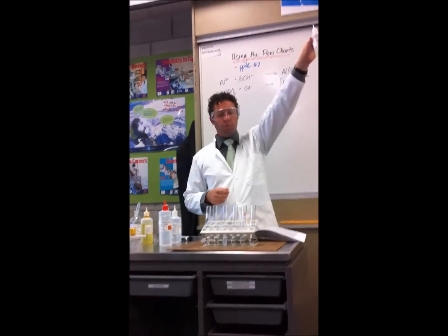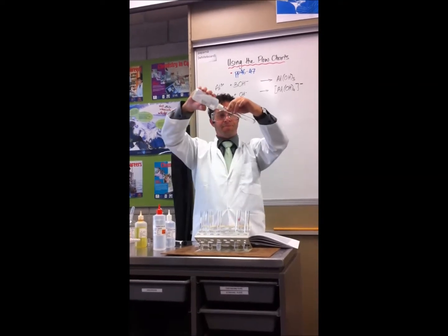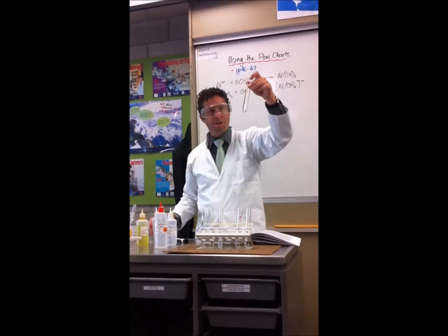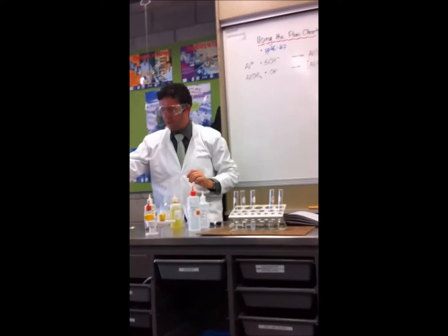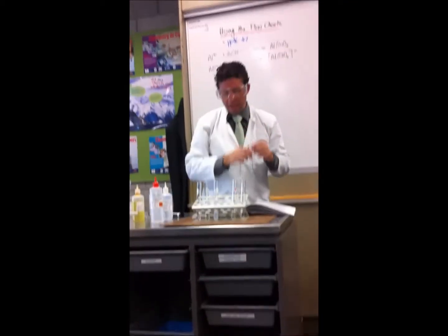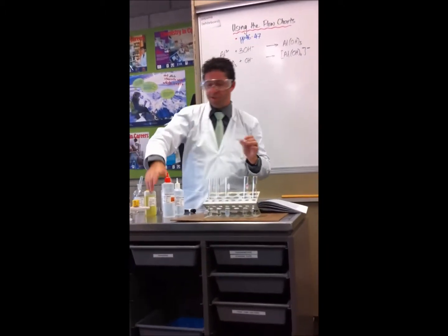Right, now I'm going to take one that I'm not going to tell you what it is. This stuff here. We'll go through the same process. So my first thing is a small amount. Whoops, I actually probably put a bit too much in that, to be honest. Right, so small amount in there. And the first step is to add sodium hydroxide. Just a few drops.